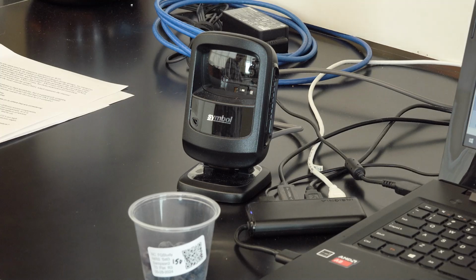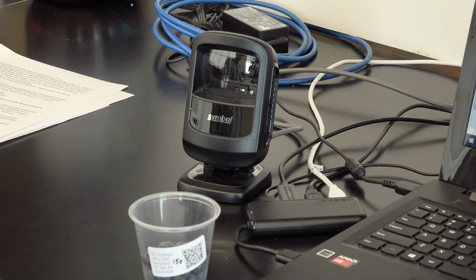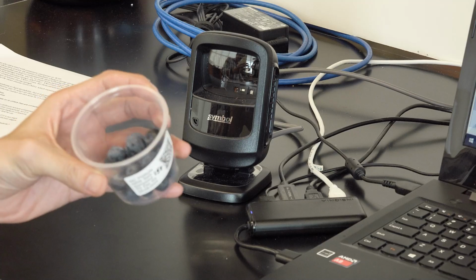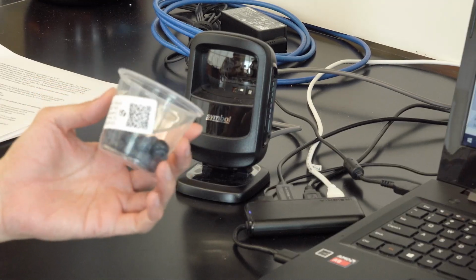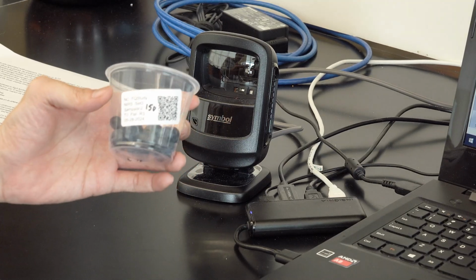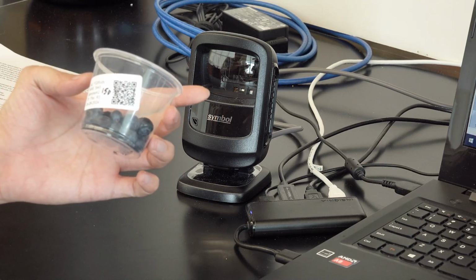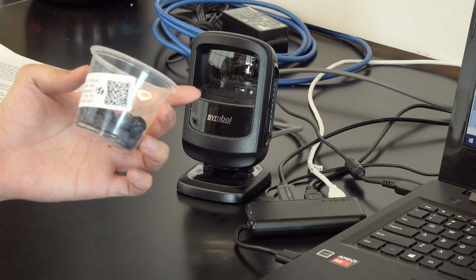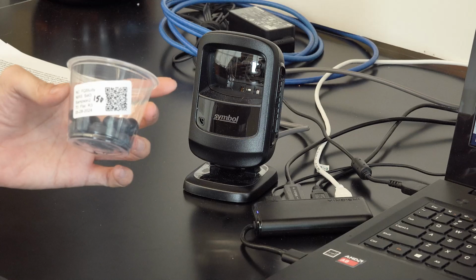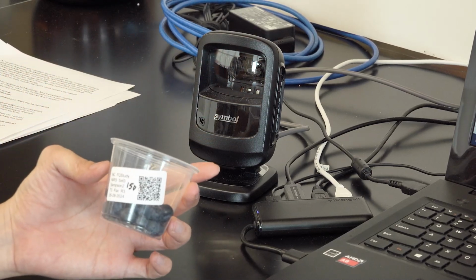When you set up the macro, you can have it include a barcode or a QR code scanner like this. You can print out stickers or labels to put on cups with your blueberry samples in it that contain information about the experiment, the sample name, the set or the rep or the date that it was harvested, etc. And the QR code would have all that information in it. And when you're running the macro, you can simply scan this barcode into the barcode scanner and it will record all the information that's included in this code.